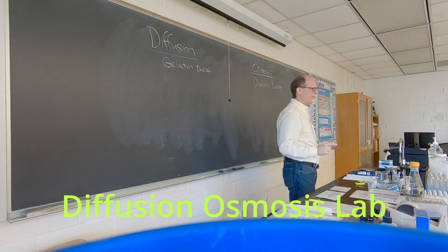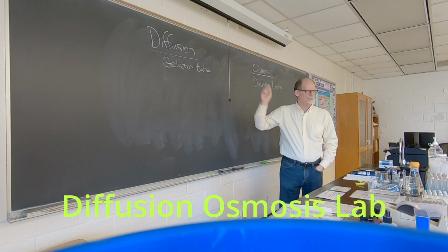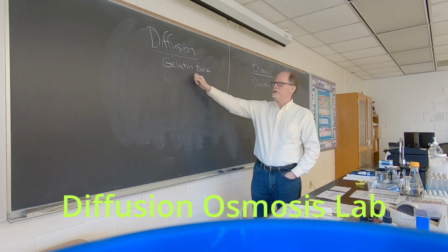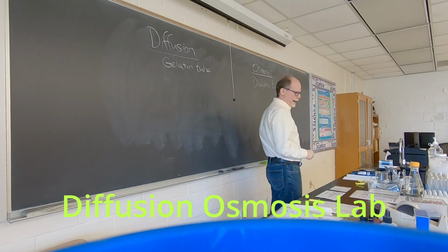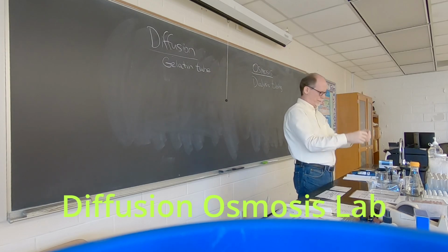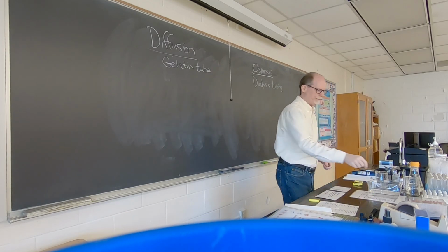This lab is the Diffusion Osmosis lab. And we'll use the gelatin tube to demonstrate diffusion, and we use what's called dialysis tubing, which is that plastic bag, right?